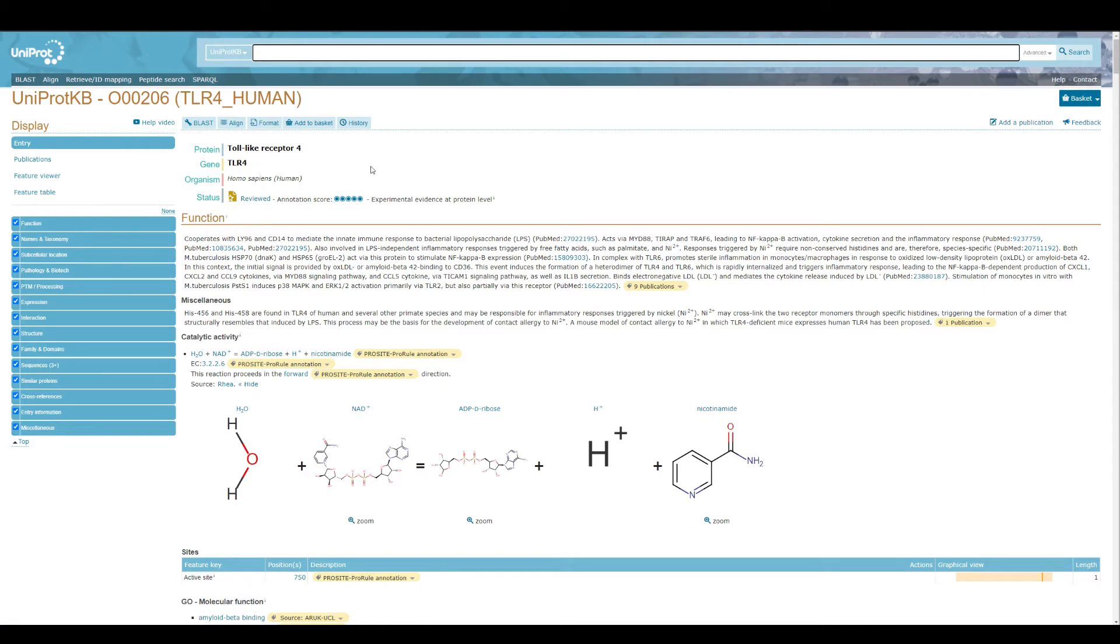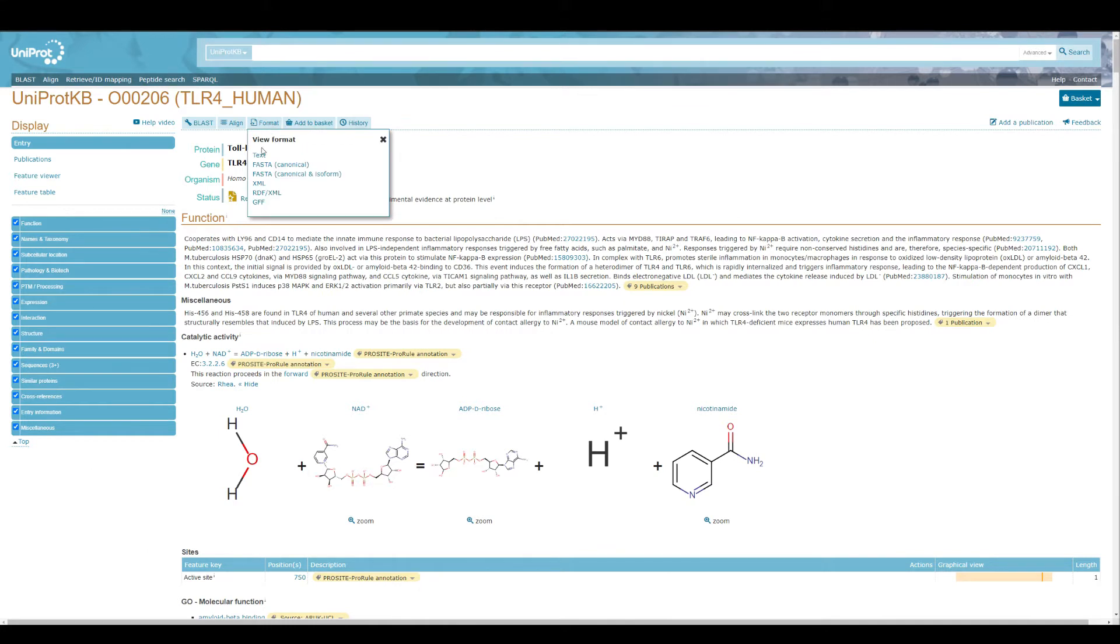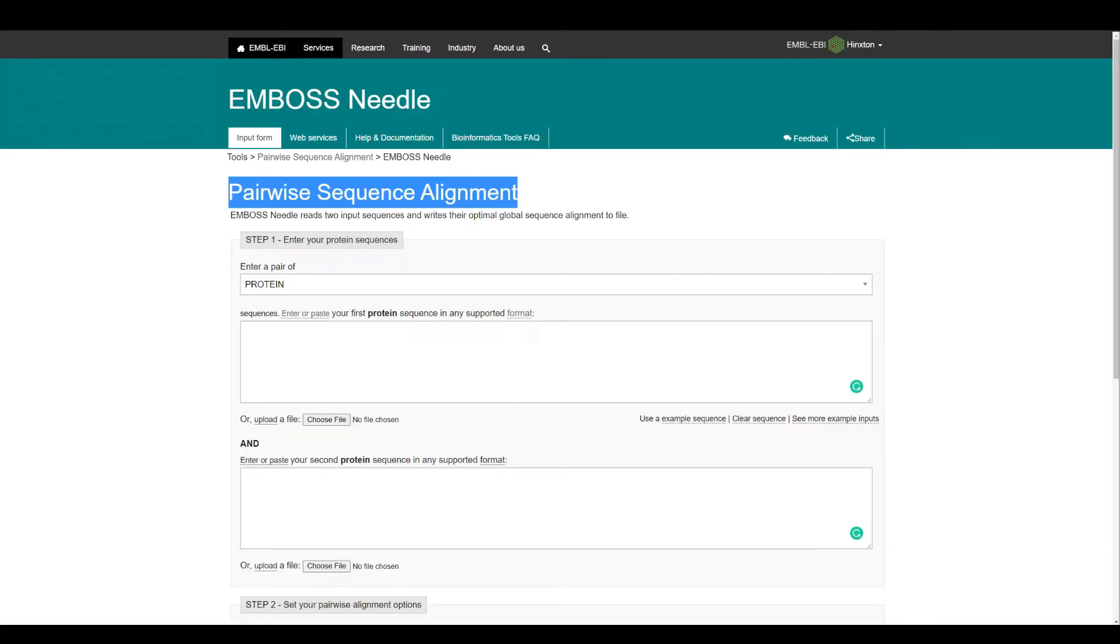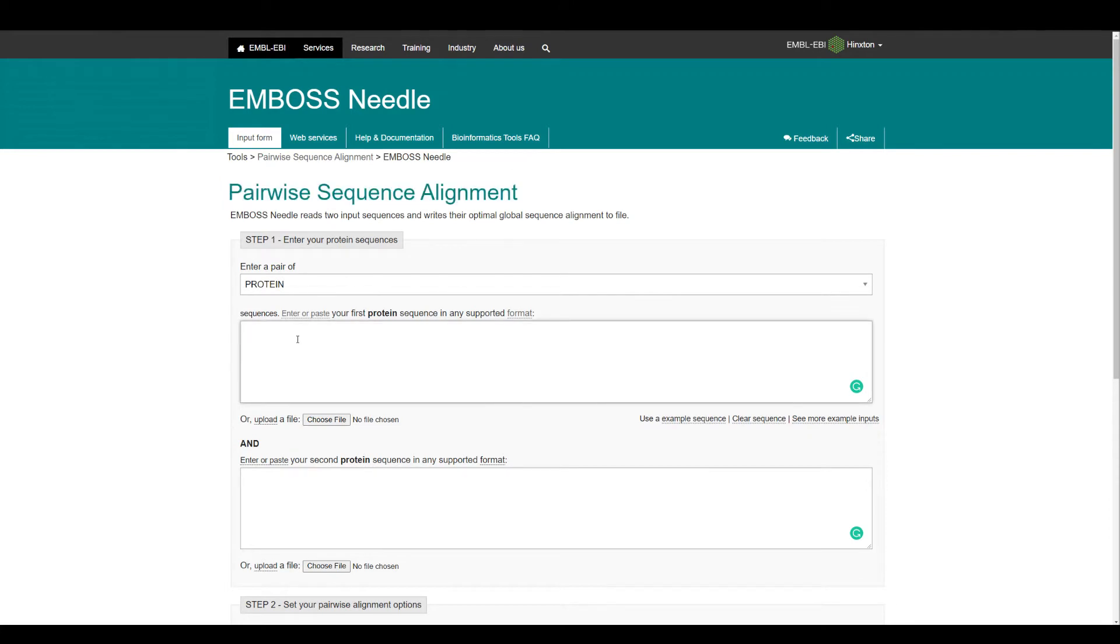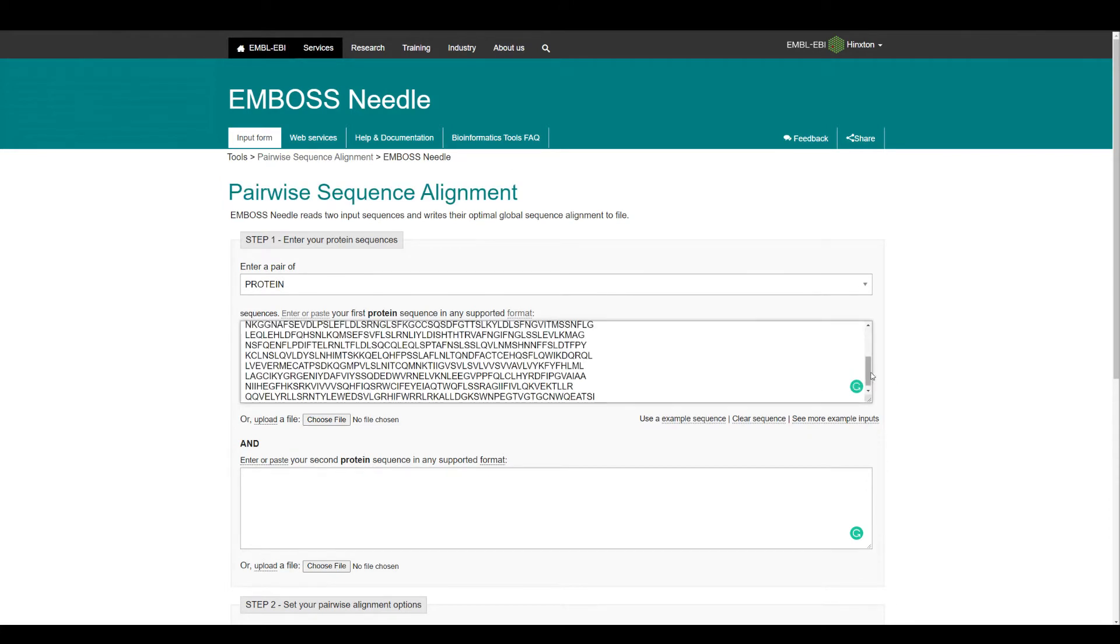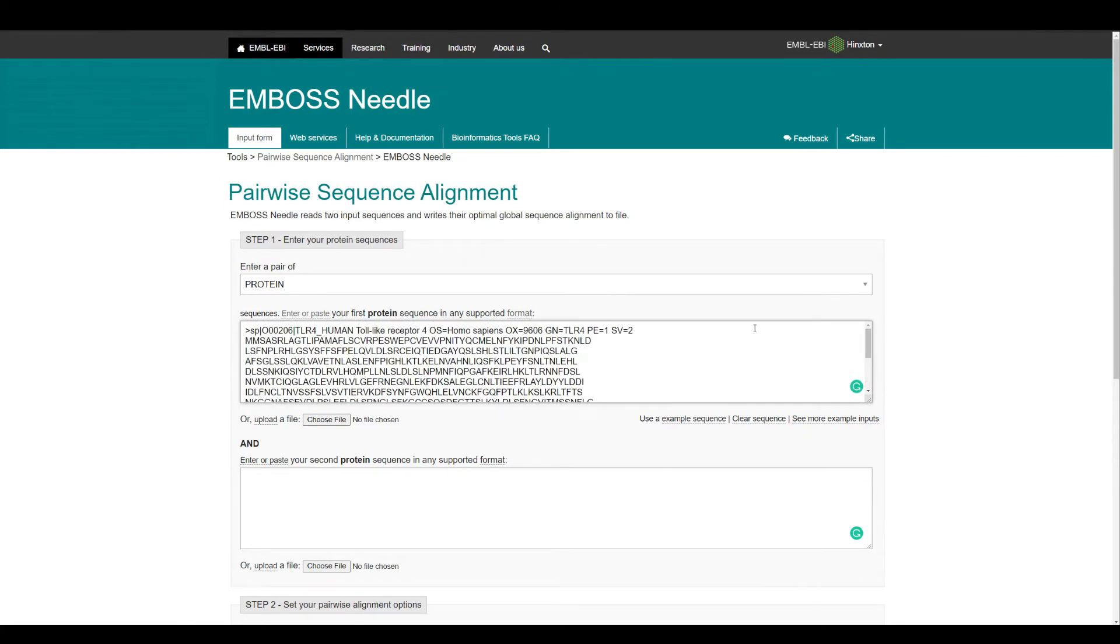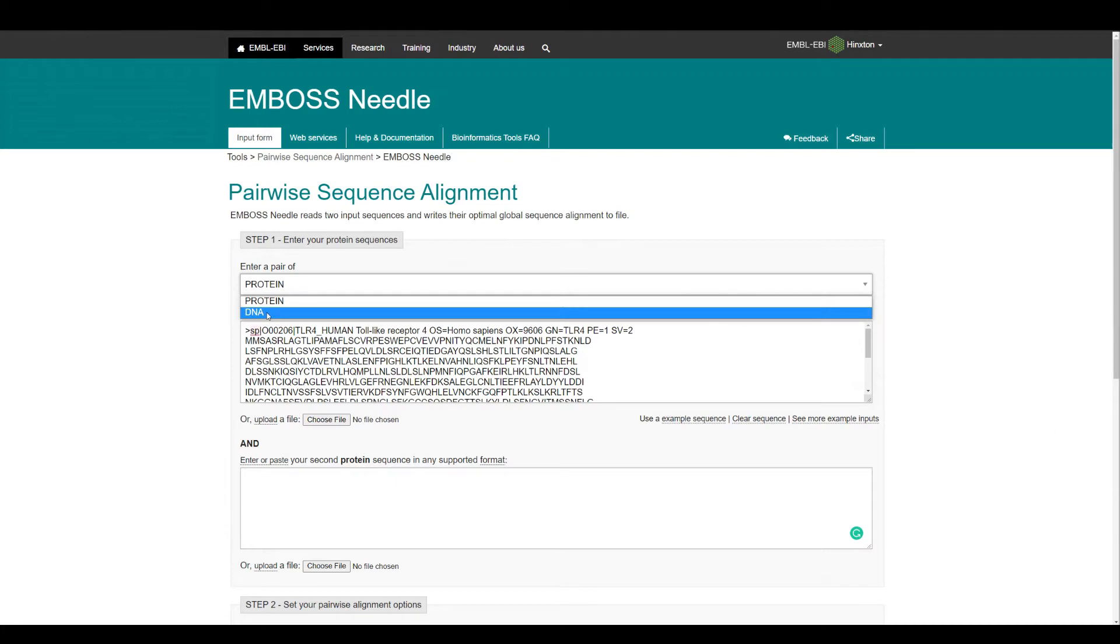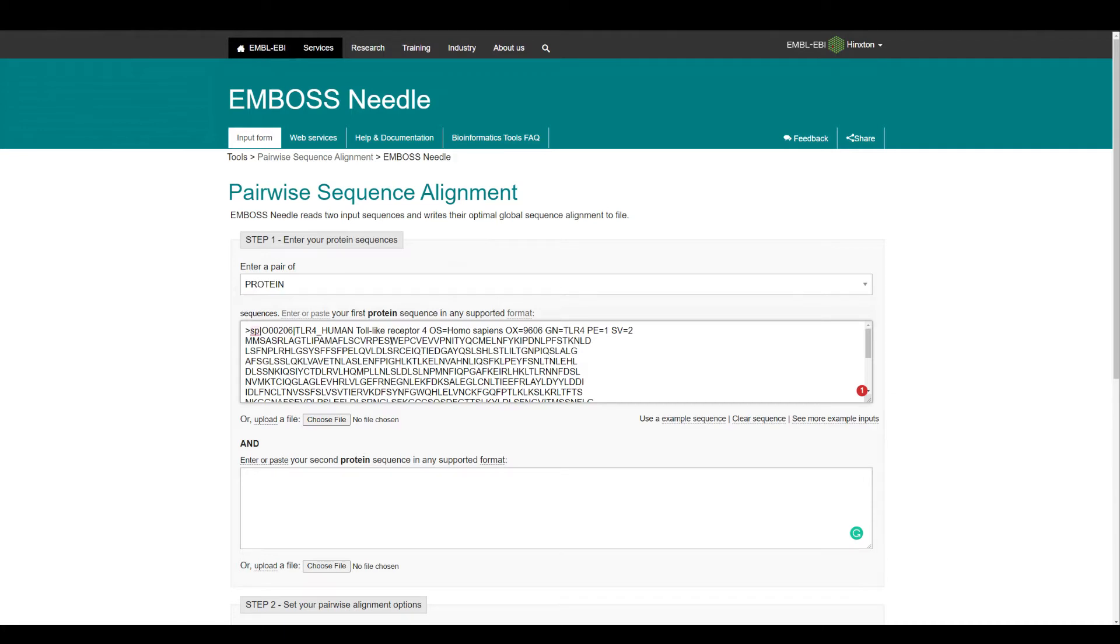I've already mentioned that you need protein sequence to download the protein sequence. What you can do is click on Format, you can get the text sequence if you want and you can get FASTA sequence. FASTA canonical will get you the full sequence. Now I'm aligning protein sequences, so I have sequence number one which is toll-like receptor 4 for humans.